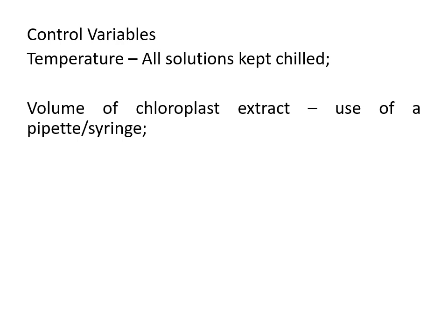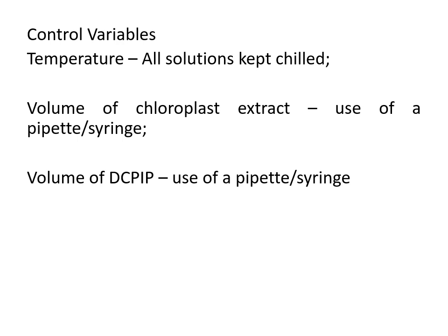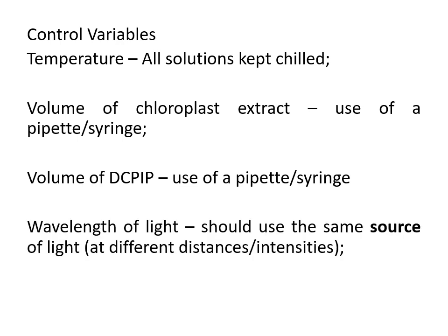So you will see in the video we have different choices of syringe sizes. We need to consider things like tolerance and percentage error in order to select the most appropriate piece of equipment. Same thing for the volume of the DCPIP solution, which is the most appropriate syringe size.